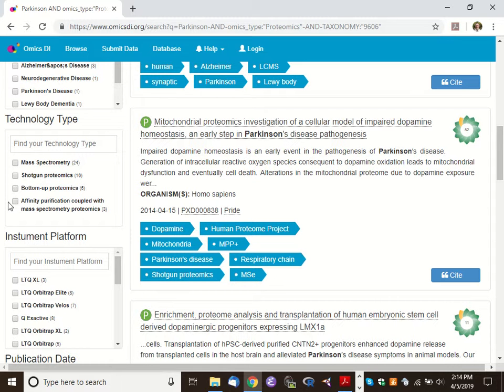Okay, so the idea here is that we have an antibody to our favorite protein, right? So now we see YFP in these conceptual diagrams. YFP is your favorite protein. Let us say we're studying Parkinson's disease. We might be very interested in parkin, which is a gene that expresses a protein that is an E3 ligase. So in this case, YFP is this parkin E3 ligase. So let us say that I have an antibody that I can use to pull out parkin.